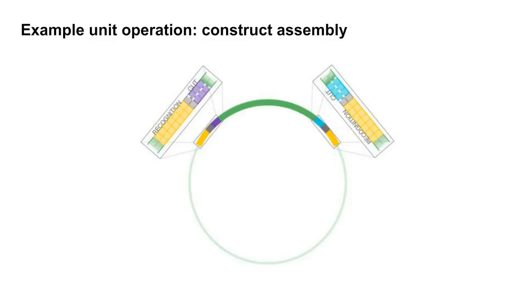Now, let's get a little bit more concrete about what we're talking about here for elements, and why systematically looking at your basic working practices is so important. So, as a synthetic biologist, if I can't make the DNA constructs, the interventions into the genome of an organism with which I'm trying to work, well, I'm kind of sunk. It's the bread and butter that allows me to unlock the entire range of genetic interventions that I'm trying to engineer to ultimately understand their function or effect on an organism.